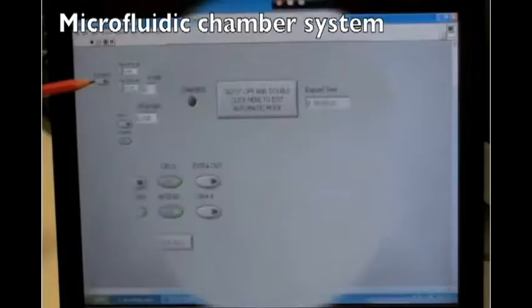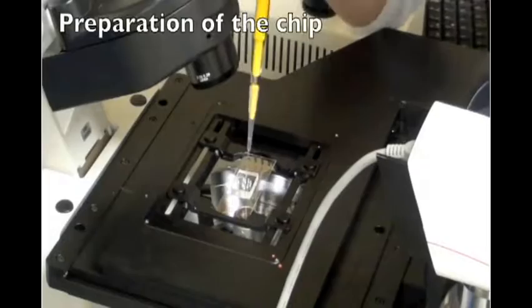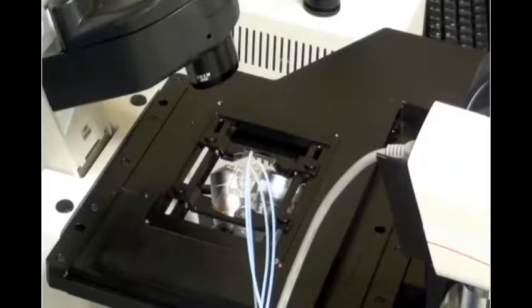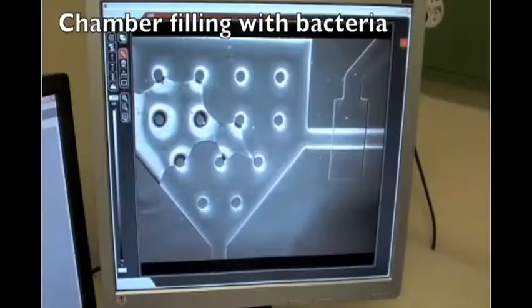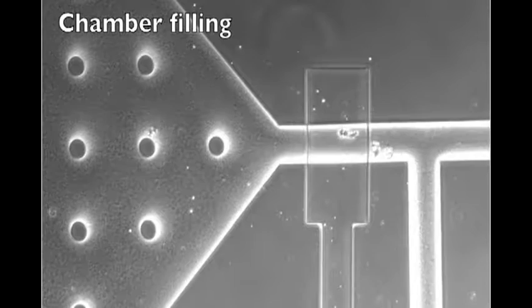This is the LabVIEW program that controls the opening and closing of the valves. Now we connect all the tubing and inject the cells in the chip. We are filling the chamber with the cells. When we want to give nutrients to the cells, we open the valves before and after the chamber.